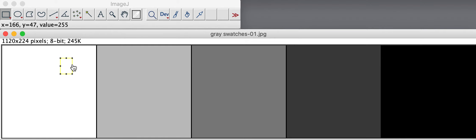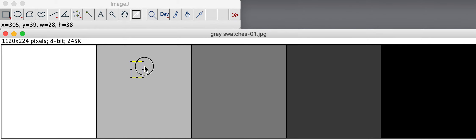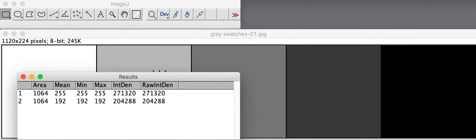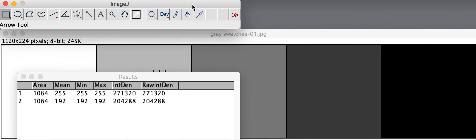You don't want a hand. That would let you stretch or resize. When you get the black arrow, you can drag that same shape into a different sample. Command-M or Analyze Measure again. That adds a second measurement to the results window.